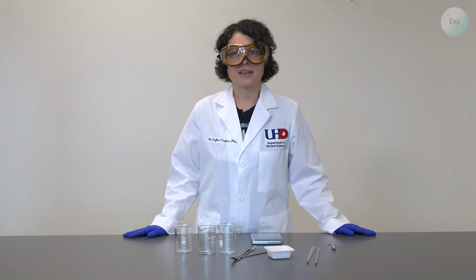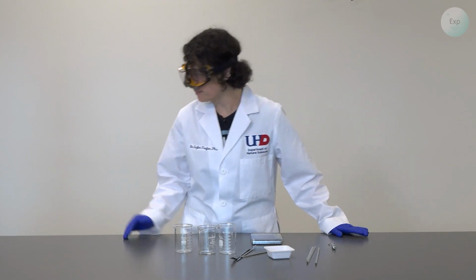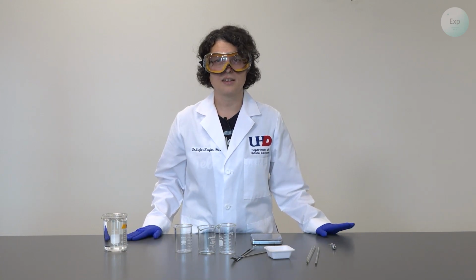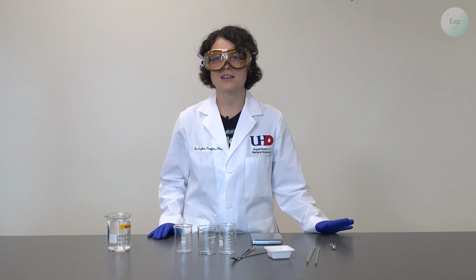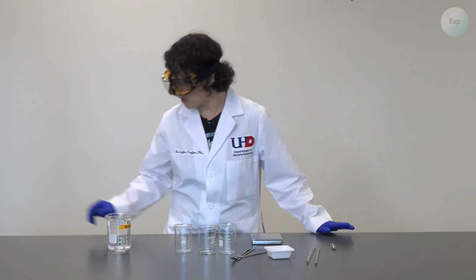As far as our chemicals are concerned, the only one that you must have is deionized water. And that's here, because we are determining the solubility of ionic compounds in deionized water, so this is the most important thing. The second important thing is to find a collection of chemicals that are sharing either the same cation or the same anion. Let me demonstrate.